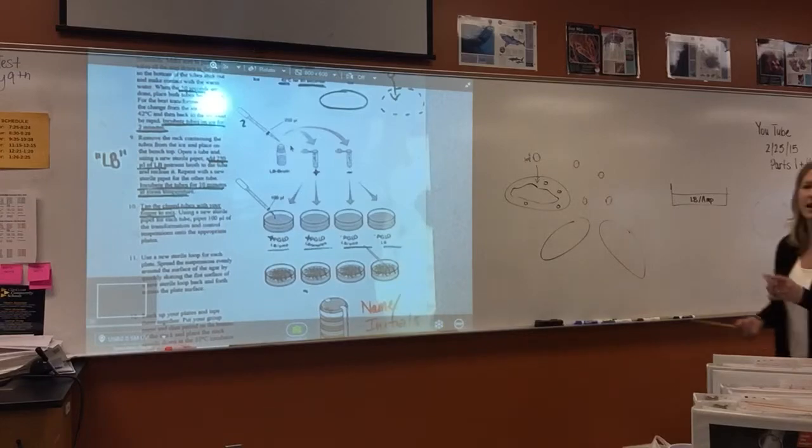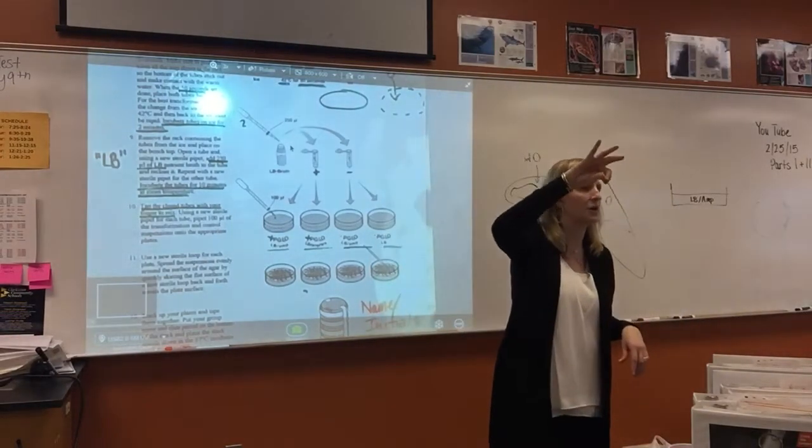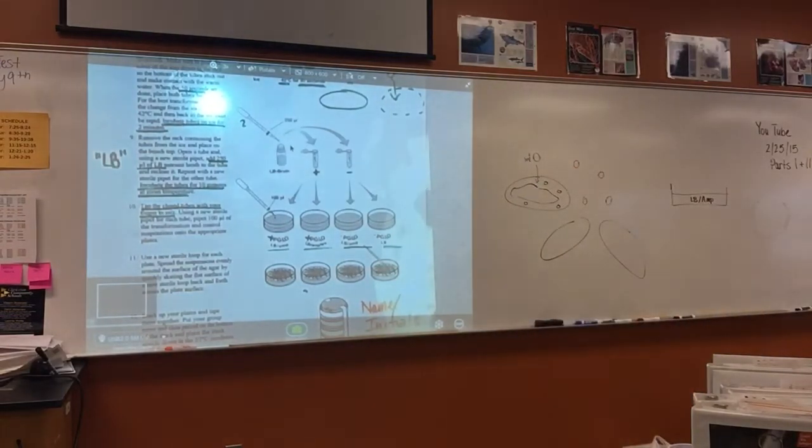I will have a bag hanging off the overhead projector that all the contaminated stuff can go into, like all your loops and things like that as you use them.